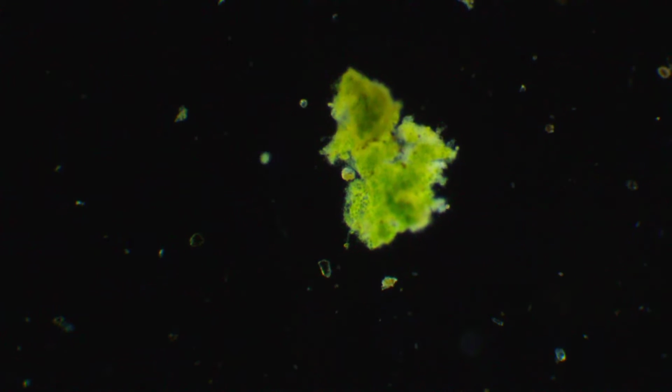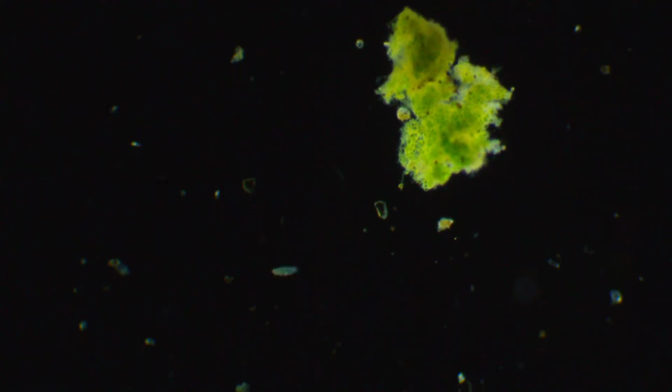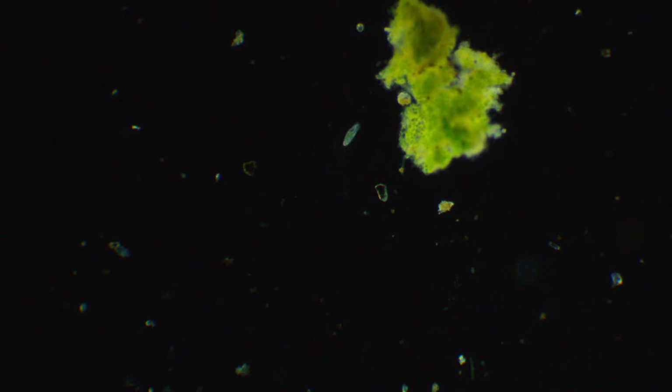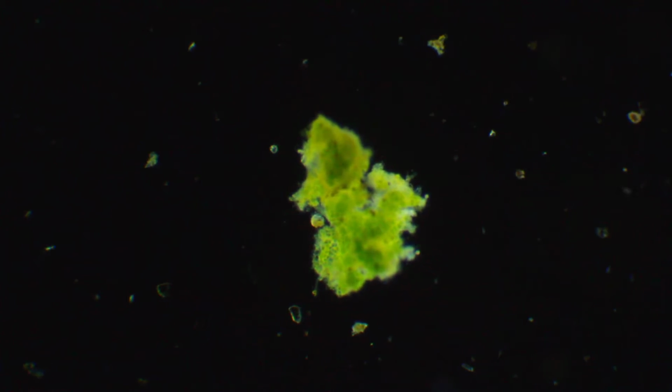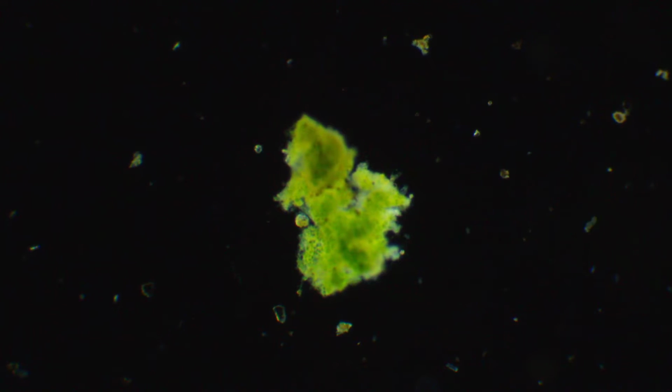Oh, look. Paramecium right off the bat. I didn't even look. So that looks like classic paramecium. Hopefully, if he settles down and gets out from underneath this thing, I can see him.